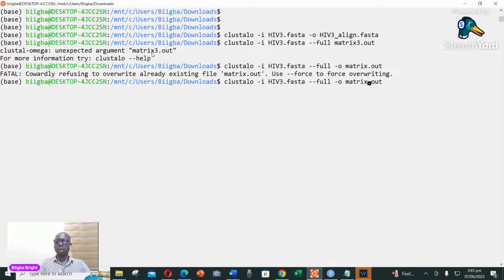So I'm going to come here and just add _1 or something like that, because I've already got an output file called matrix.out, and that is why. When I added a tree to it, it didn't understand, so I just put an underscore. So that's going to be the file over there.